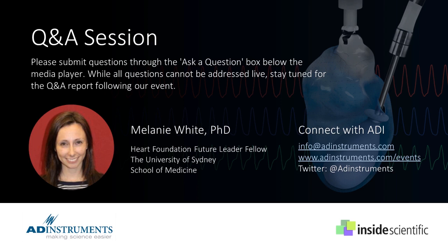Yeah, this is really important. And as you mentioned, we did sort of touch on it in the presentation, but the time period that we're looking at is not the time from the injection of the anesthesia or from inhalation of the anesthesia, it's from opening the diaphragm. These animals have only been heavily sedated until that point. It's opening of the diaphragm that removes that negative pressure in the pulmonary cavity that leads to the death of the animal. So that period should be measured from the opening of the diaphragm to the hanging of the heart. And we really do try to keep it as short as possible.